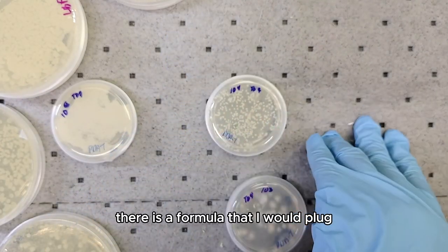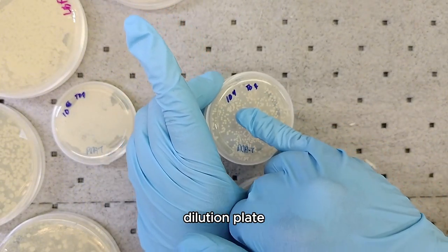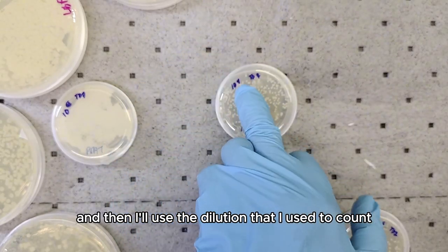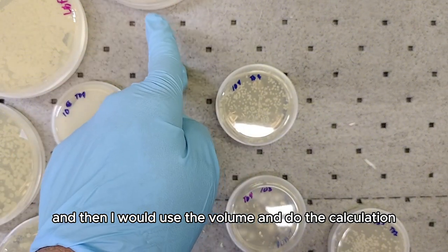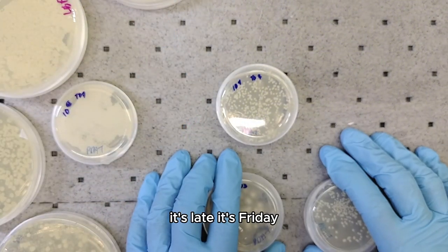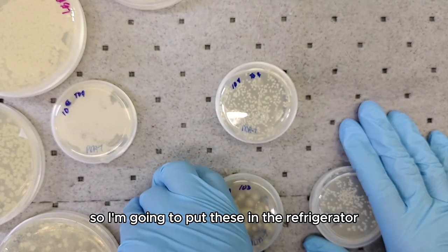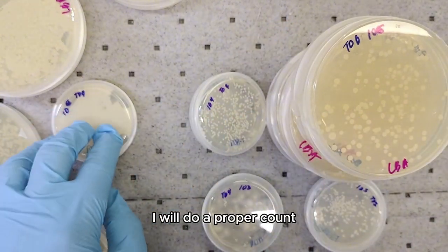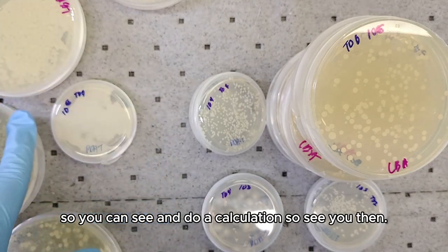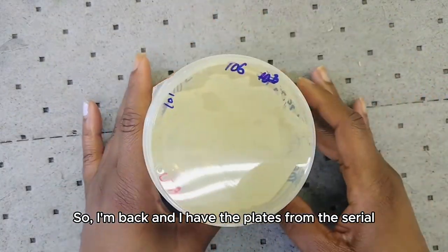There is a formula where I plug in the number of cells counted on the selected dilution plate, the dilution used, and the volume plated to do the calculation. It's late Friday and I've been here more than eight hours, so I'm going to put these in the refrigerator to slow their growth. When I come back I will do a proper count and calculations.